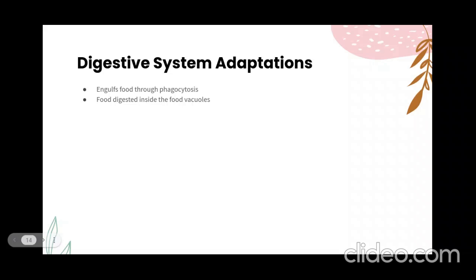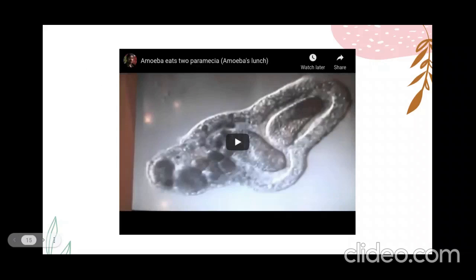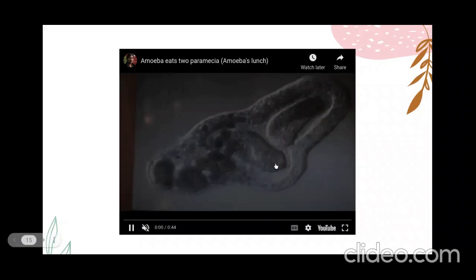Along with the body movements, the food vacuoles are brought well inside the endoplasm. Inside the endoplasm, hydrochloric acid from the inner membrane of the vacuoles works on the food. It kills the living food materials and makes the contents acidic. This is a video of the amoeba.